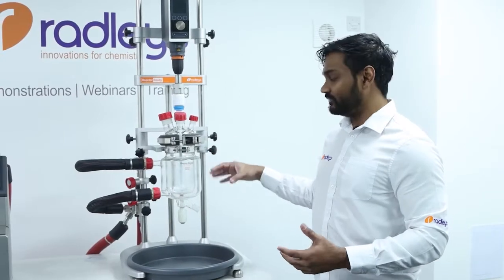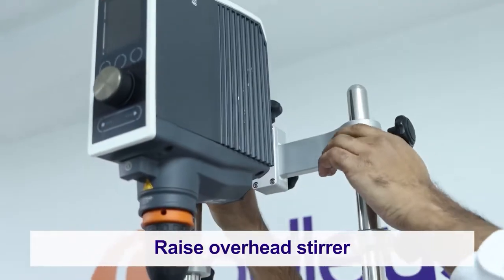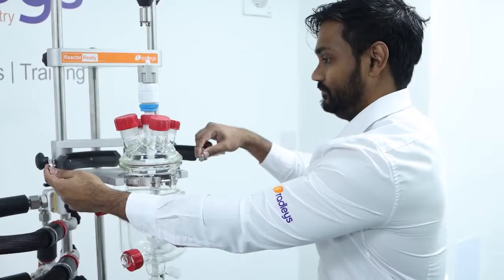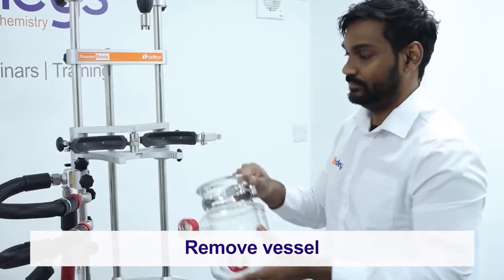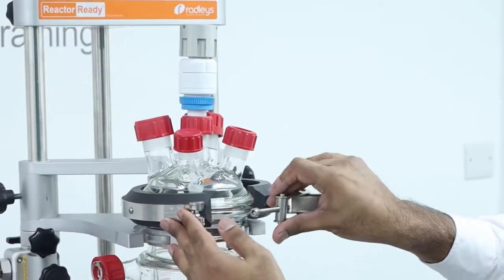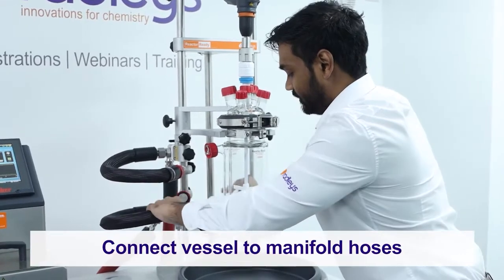Now that all the thermal fluid has been drained from the vessel, we're free to swap it for a new one. First, we'll lift the overhead stirrer up using the I-beam. We'll disconnect our vessel-to-manifold hoses and secure them. We can then open the quick clamp, remove the lid and the o-ring, and remove the vessel from the framework. We're now free to load our new vessel into the framework, replace the o-ring and the lid, secure the vessel with the clamp, drop the overhead stirrer back in, and finally reconnect our vessel-to-manifold hoses.